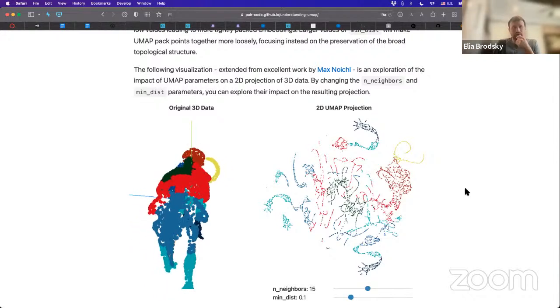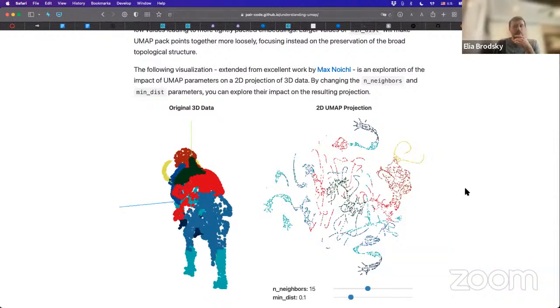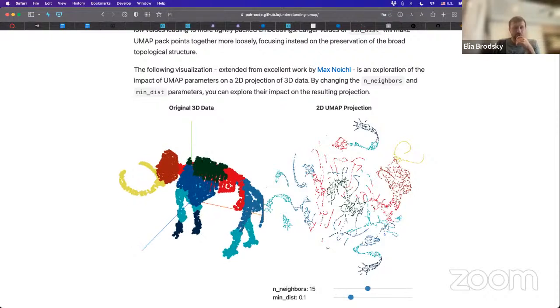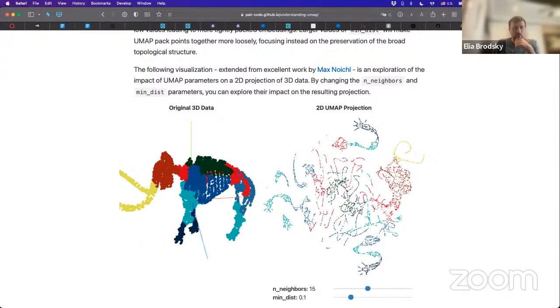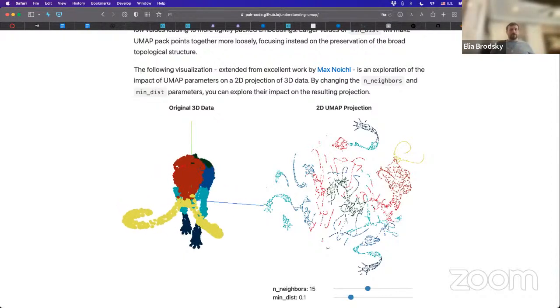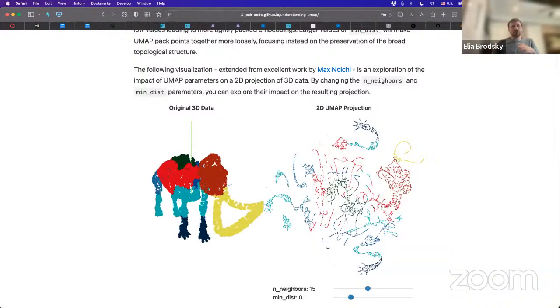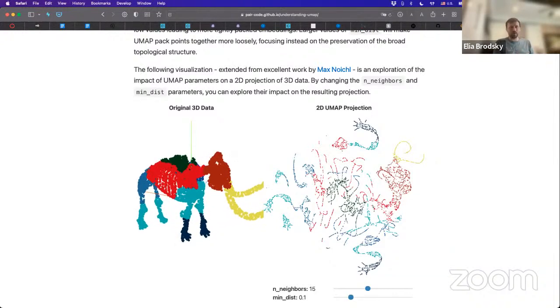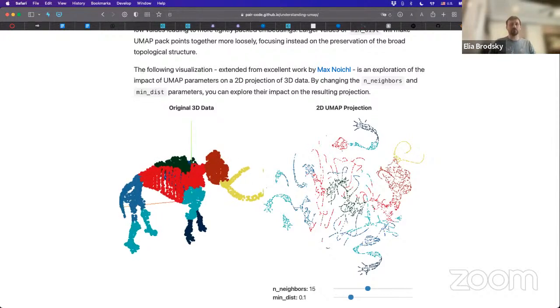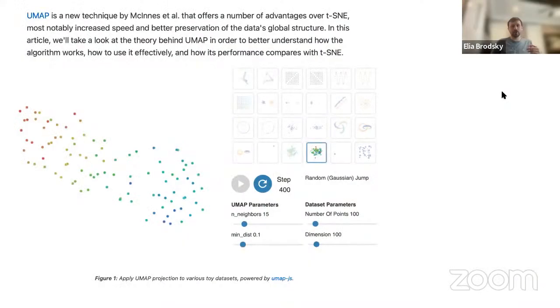Okay, so Aditayo is asking which parameters are available on the TBio server. Great question. We will get to that in just a few more minutes, okay? Again, your understanding of methods, your understanding of the parameters of these methods, your experience working with a lot of examples is what builds your confidence when you actually come to a real practical challenge that you might see in your own data set.